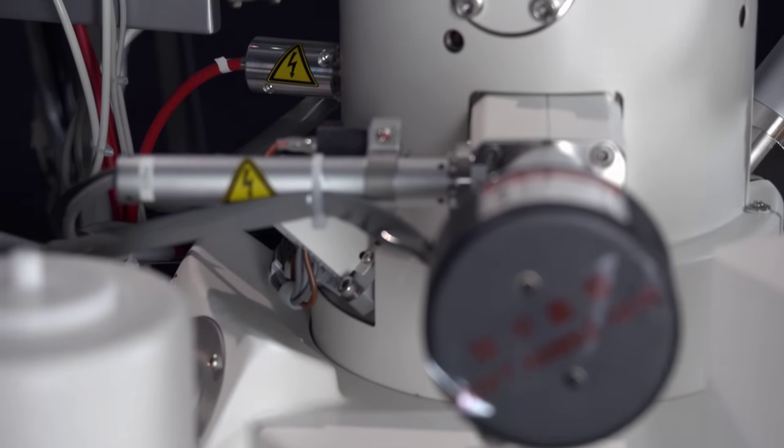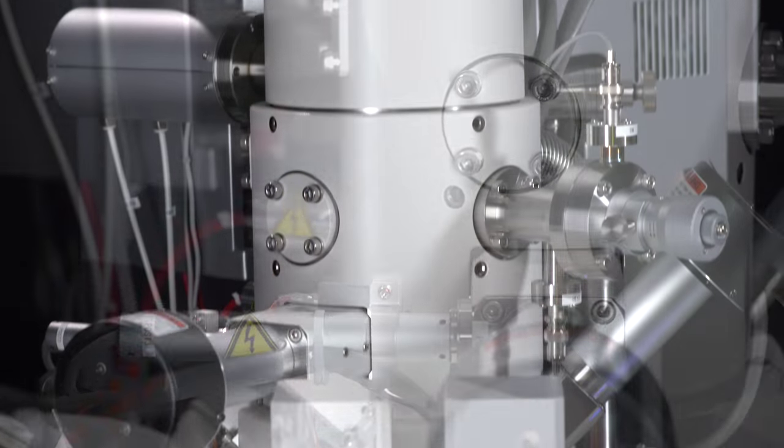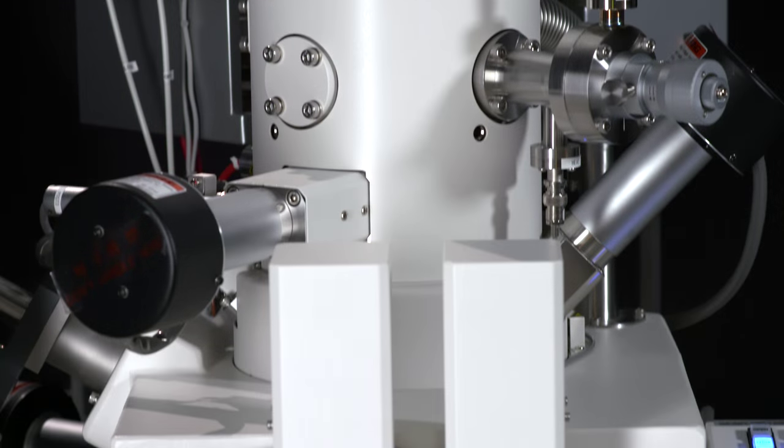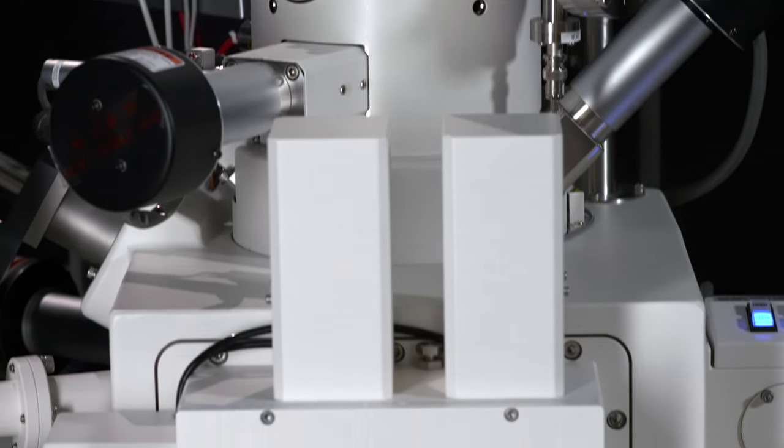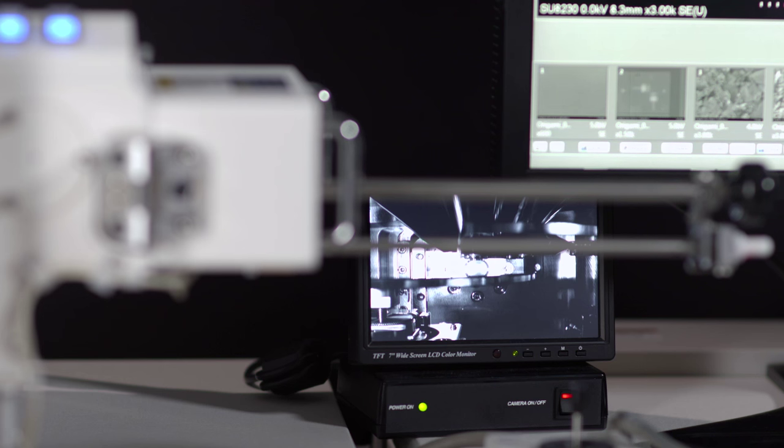The SU8200 series novel CFE gun technology employs our patented mild flashing technology and an advanced vacuum system design, which greatly minimizes gas molecule deposition on the emitter tip.